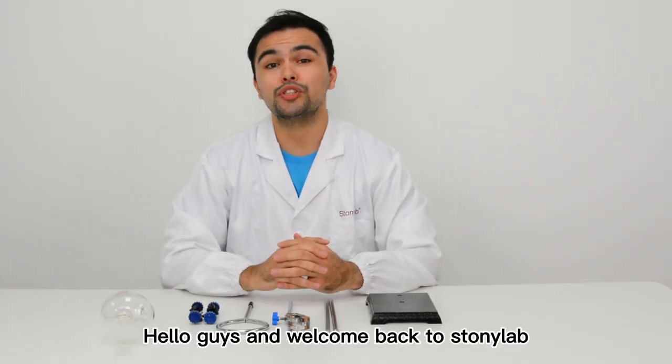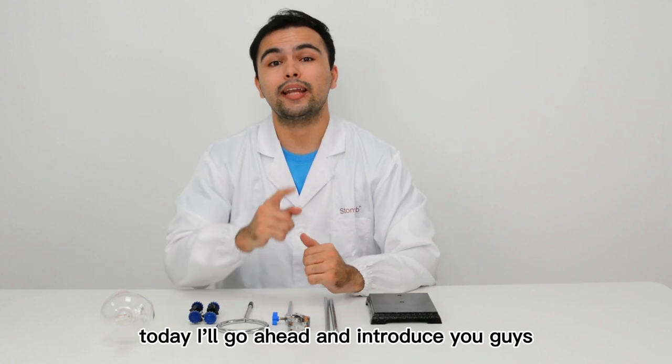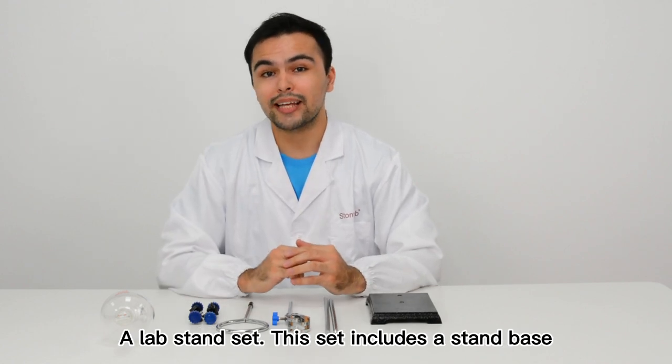Hello guys and welcome back to StonyLab. Today I'm going to go ahead and introduce you guys a lab stand set.